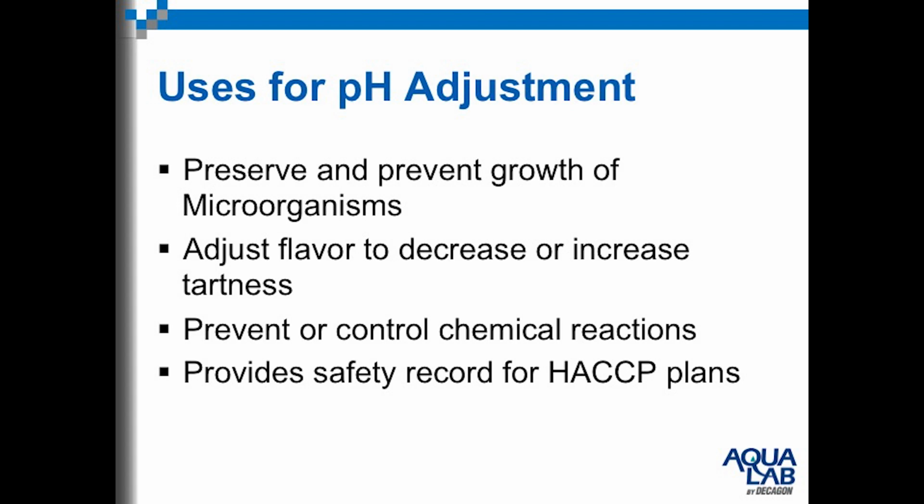And then again, like with water activity, if a product is acidic, and that's the critical control point, that the product is acidic to prevent growth, then the way to verify that, or the tool to use then, would be pH measurement. And then you would want to keep a record of the pH measurement values that you obtain for a food product.